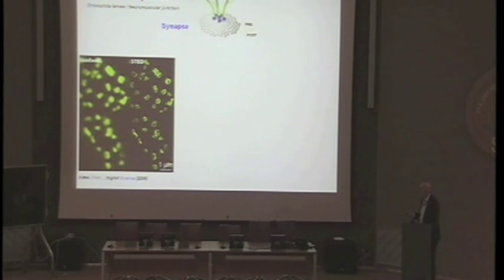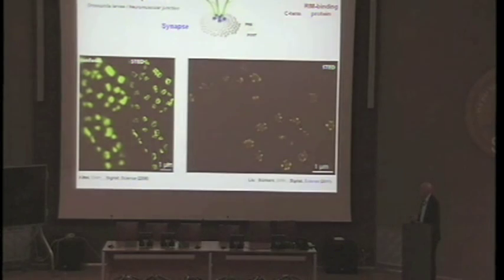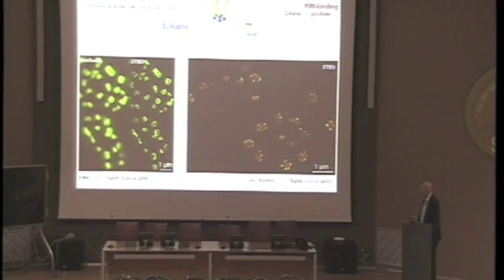And you see here, it has been found instantly when taking the images that this protein forms this little basket when it arranges the structure, protein structure, and protein arrangement at the synapse. And without going into the details of this study, of course you can take multicolor recordings, as you can see here, labeling different terminals of the protein, and then you can arrange them in space.